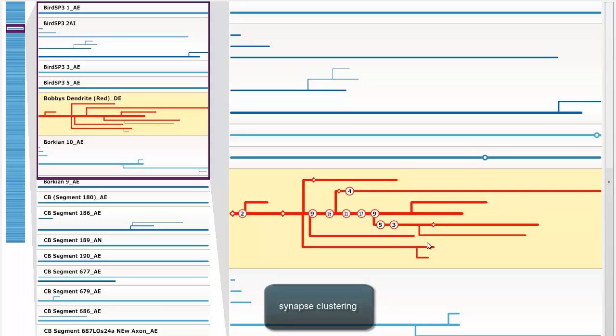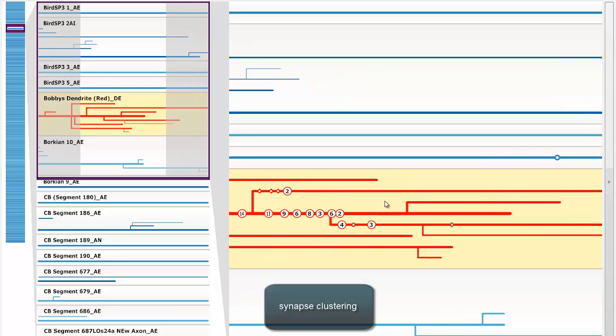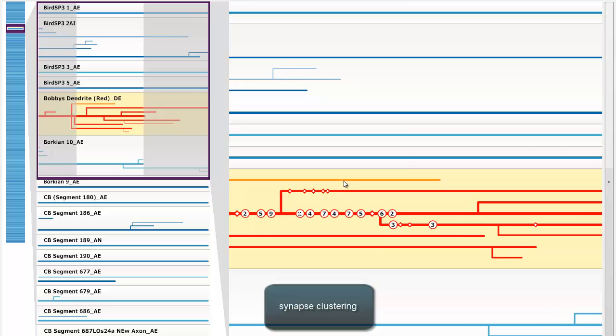Since neurites can have many synapses, we cluster overlapping synapses. Here you can see the user zooming in along the length of a neurite. Notice how the synapse clustering gets continuously updated.